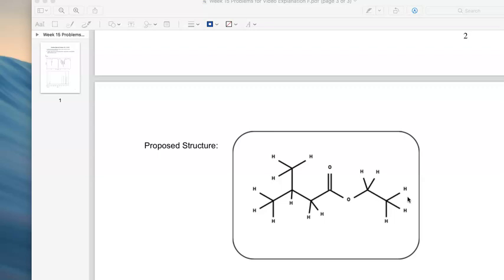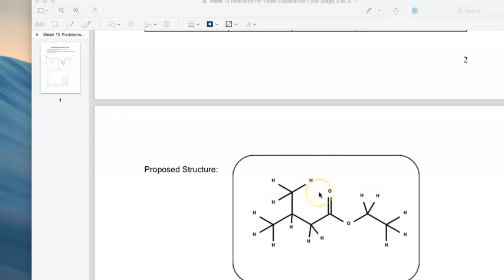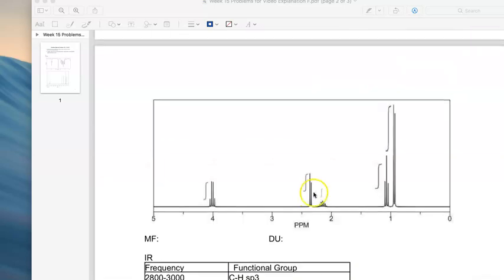So looking at the hydrogens of group 1, they have 1 neighbor. On this carbon there is 1. So using the formula n+1, we get 1 + 1, which equals 2. So this is a doublet when looking at the graph. We can distinguish it, so it'll have 2 peaks, and we have 2 doublets on this spectrum. But the carbons we're looking at, there were 6 of them, so it's going to be this higher peak.